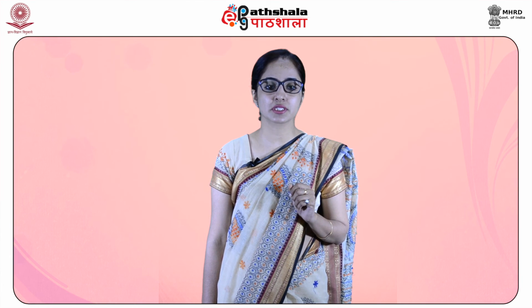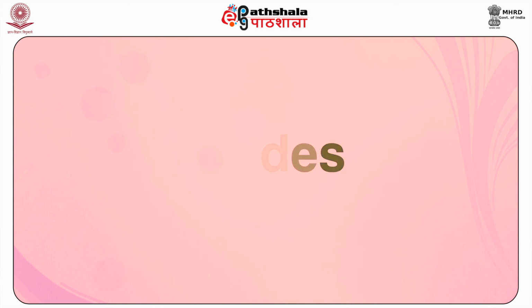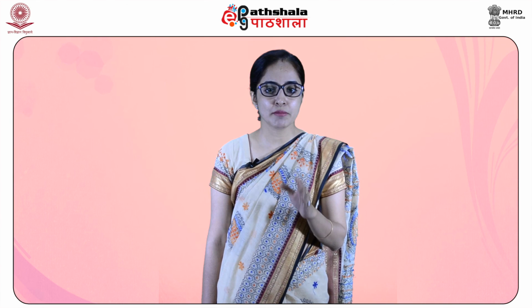Now, let us come to the discussion of the next and the final functional group, that is amides, in this module. Amides have three different types of hydrogens: those attached to nitrogen, that is RCONH, the hydrogens attached to the alpha carbon, that is CHCONH, and the hydrogens which are attached to a carbon which is also attached to the nitrogen atom, that can be represented as RCONCH. The chemical shift values for the protons attached to nitrogen are in the range of 5 to 9 ppm.